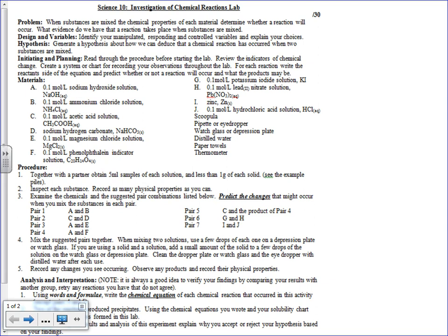So they are pretty strong, so you do want to make sure if you get any on you, and I don't care which one it is, go straight to the sink and rinse in cold water. Well, that's all you have in your sinks is cold water. Rinse for at least 2 minutes, if not 5 minutes.